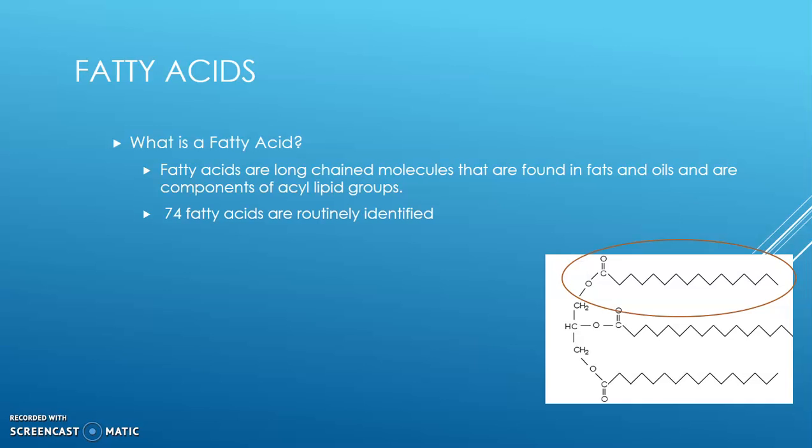We identify 74 fatty acids. Routinely, we look at fatty acids from C14 to C24:1, but we can analyze from C8 to C30. We don't routinely do the shorter chain fatty acids because they are extremely volatile and therefore hard to measure.